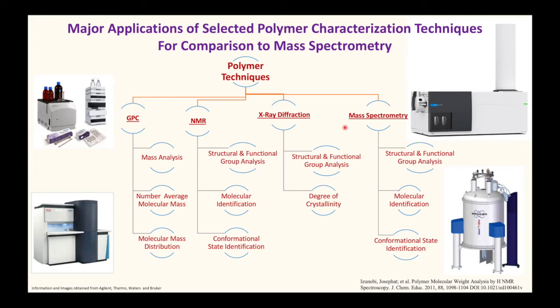Mass spec analysis is dependent on the sample conditions, where consideration of the polymer's ability to ionize is critical. The ability for polymer ionization is dependent on the mode of polarization, the sample matrix such as the pH, and the ionization efficiency of the specific polymer. NMR analysis does not require these additional steps in the sample preparation process.